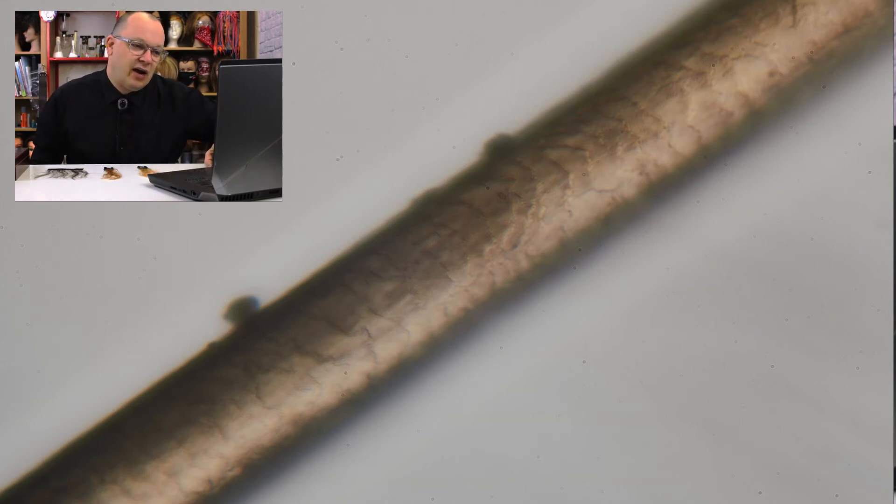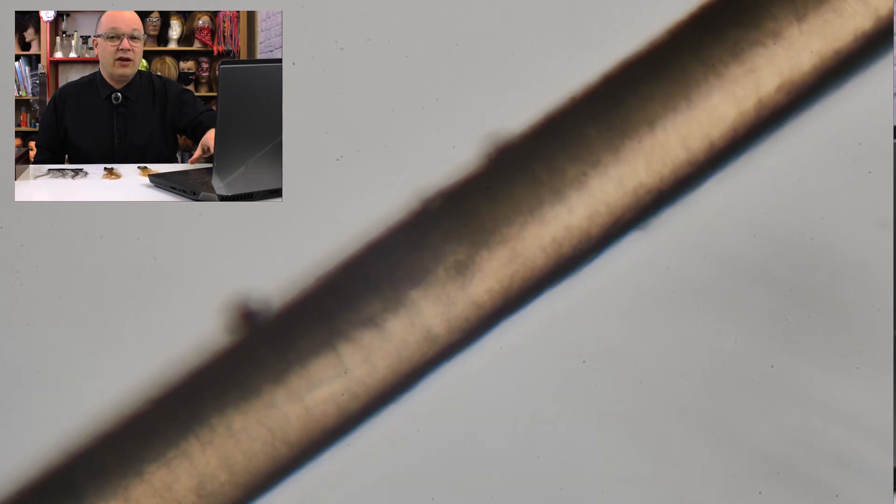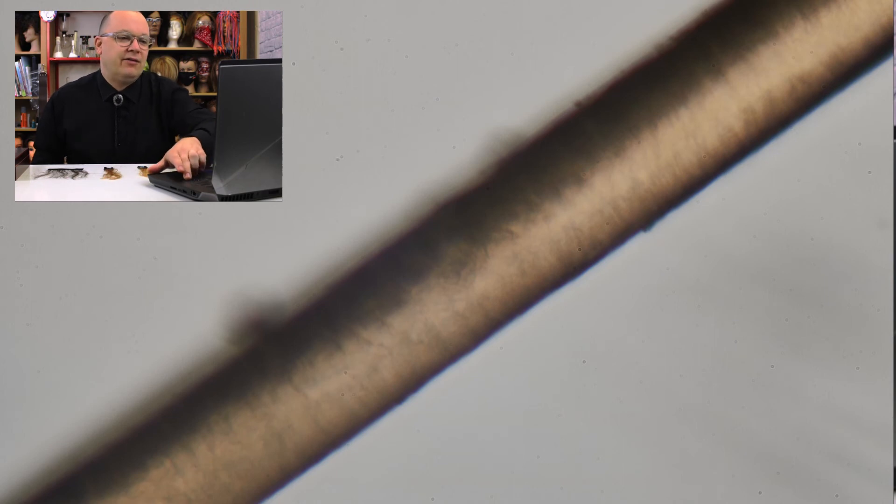Here's one where we can see the surface of the hair really well, and you can see the broken cuticles have gone out of focus a little. The fact that the cuticle is so much more visible — and obviously this hair is lighter — the fact that I can really see individually all of these layers lets me know that we have incurred some lasting damage on this hair.